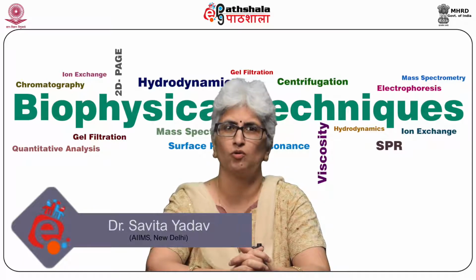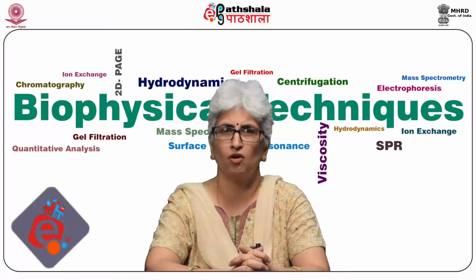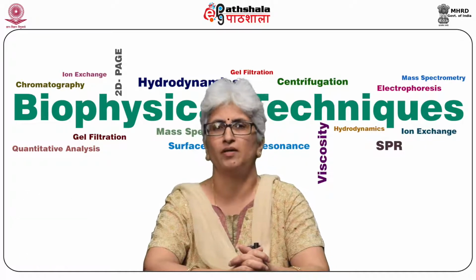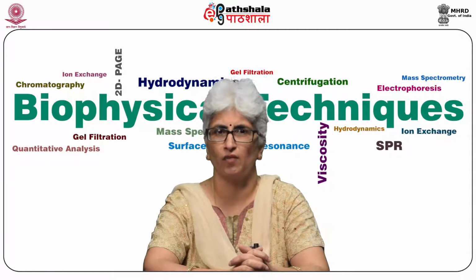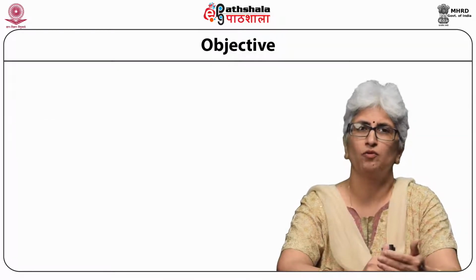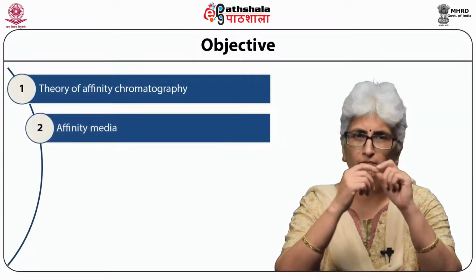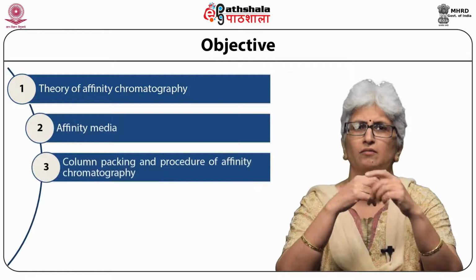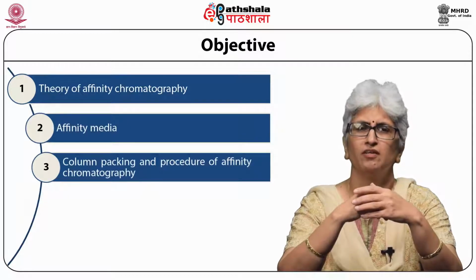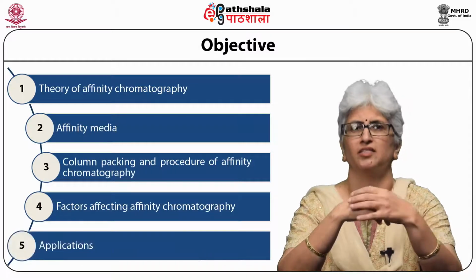Today we are going to talk on module Affinity Chromatography, Principle, Methodology and Application from paper Techniques in Molecular Biophysics 1. So what are the objectives of this module? What are we going to learn from this module is theory of affinity chromatography, affinity media, column packing, procedure of affinity chromatography, which are the factors which affect affinity chromatography and its application.